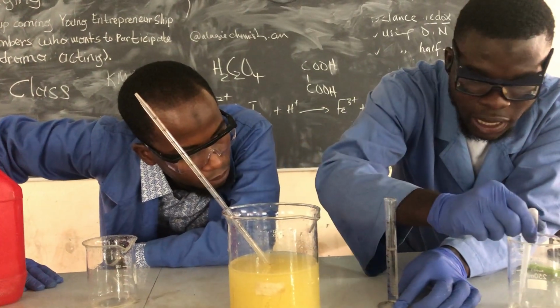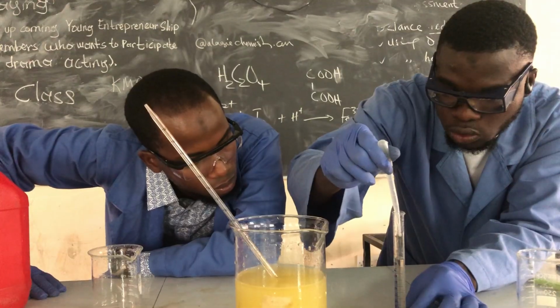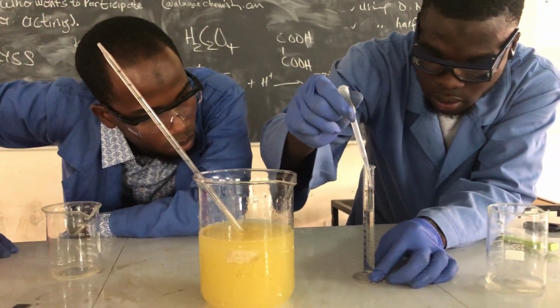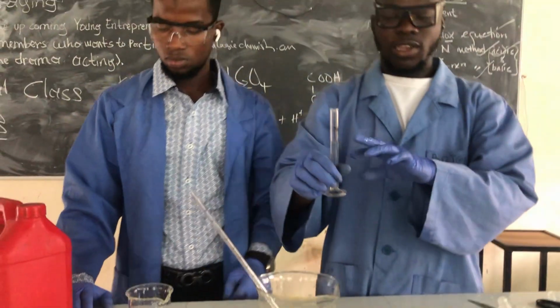The reason why we are adding the acid is to stabilize the iron(II), so that it does not oxidize to iron(III).